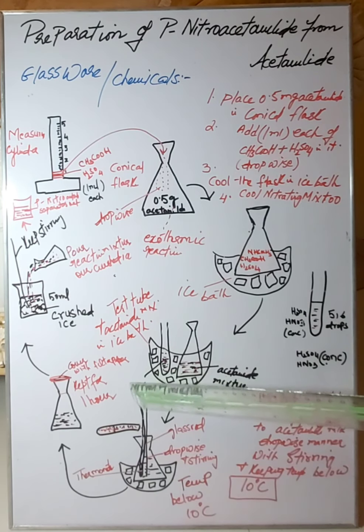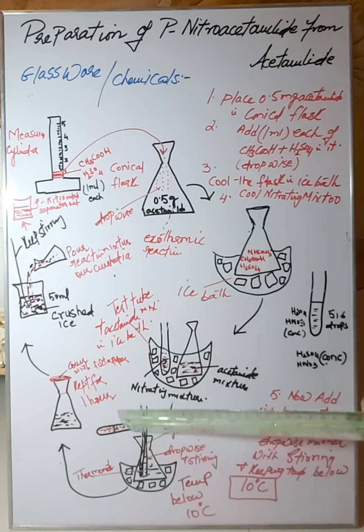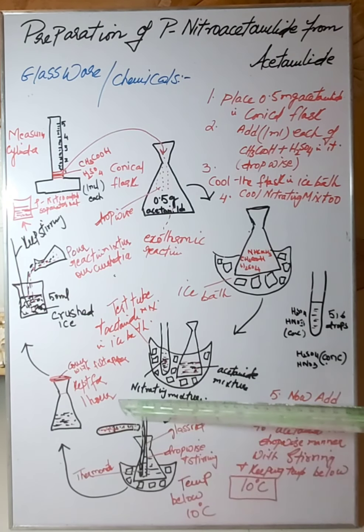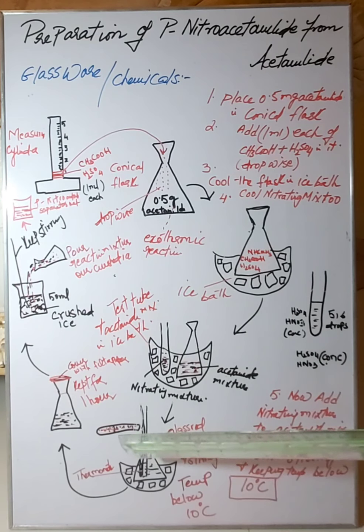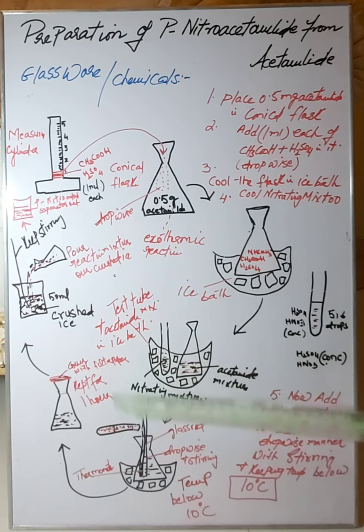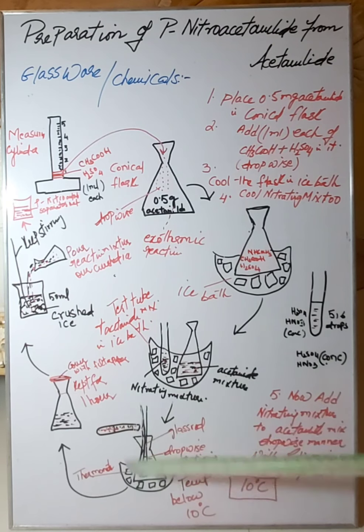This is a glass rod, and you can see a thermometer. The thermometer is also inside this flask, so that you can note down the temperature, which should not exceed 10 degrees centigrade. So you have to be very careful. Your eyes are supposed to be fixed on your watch, so that the temperature is around 6 to 7 degrees centigrade, not more. After the addition, take time when you are adding up this mixture. You must take a few minutes when you are adding these two mixtures together.